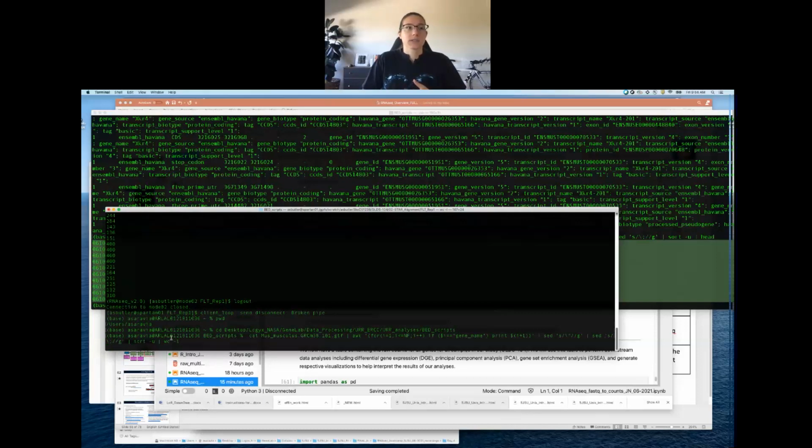This will tell us the number of unique gene names. And if indeed I was remembering this information correctly, then Zinru is right that we should see fewer unique gene names than we do unique gene IDs.